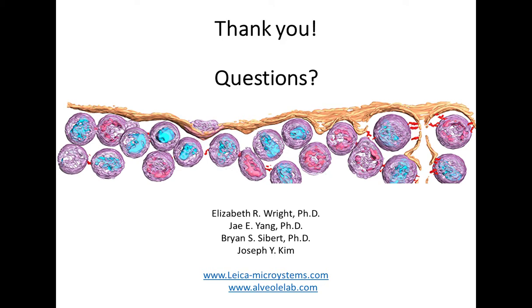I thought the sample still gets very quickly degraded from the electron beam in cryo-EM. Is that true? Yeah, it is true. Just like all of the cryo samples, biological samples, you still need to image your samples in low dose mode under the electron microscope.